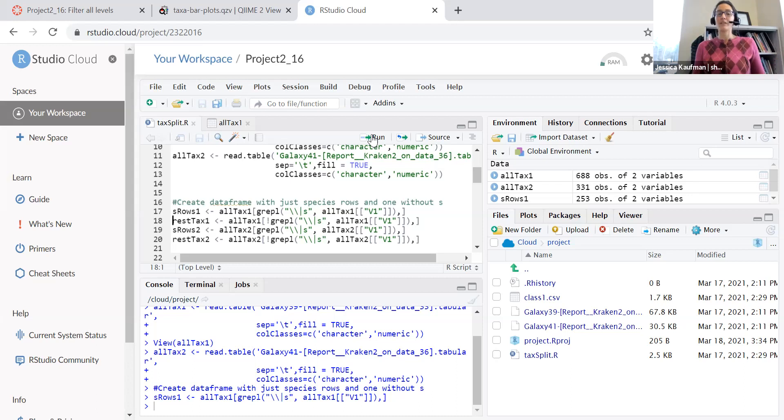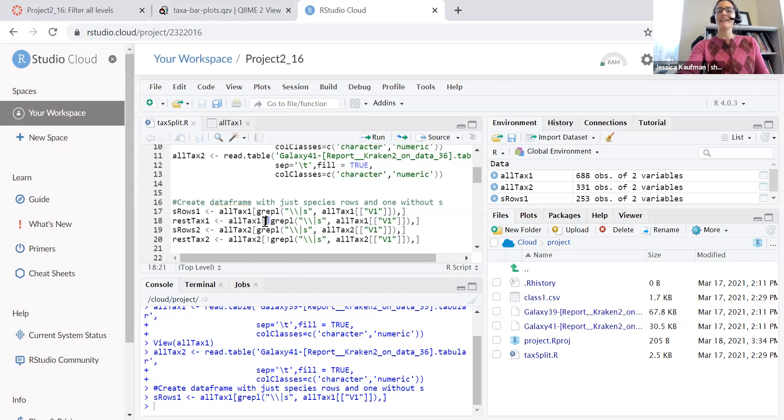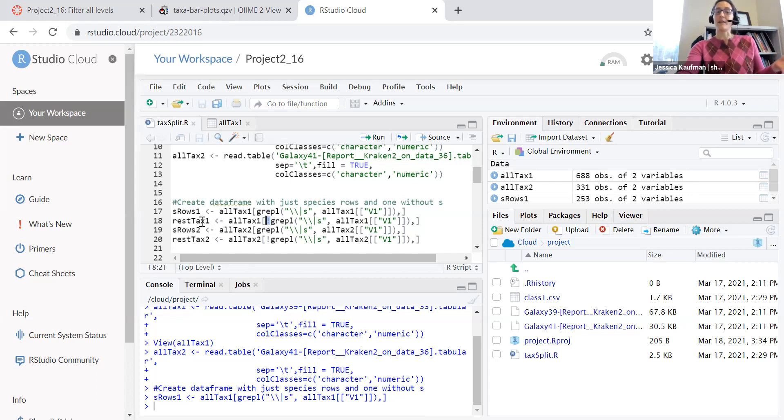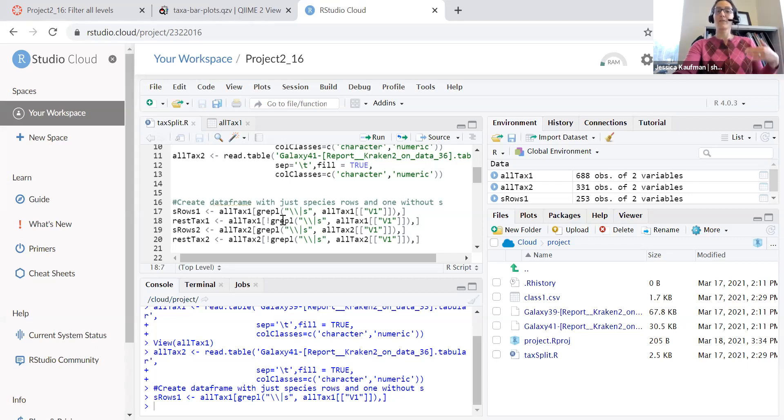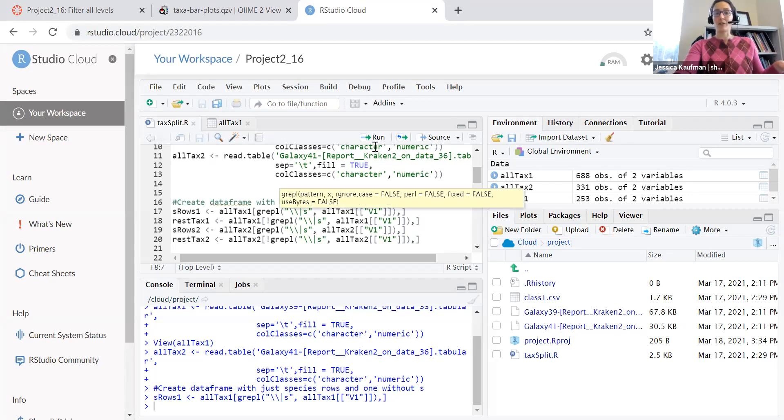How do I do that? The same command, altax one, but I put an exclamation point in front of the Grappel so that this data frame, rest tax, and I called it rest tax because the rest of the taxonomic levels, don't include the species rows.